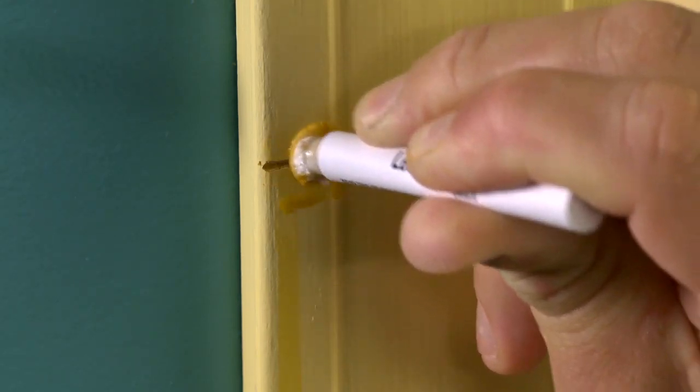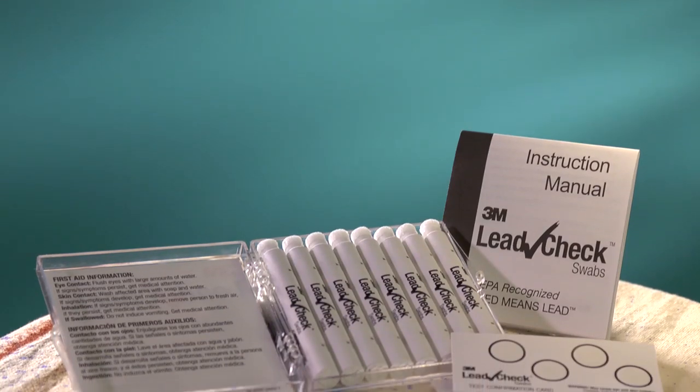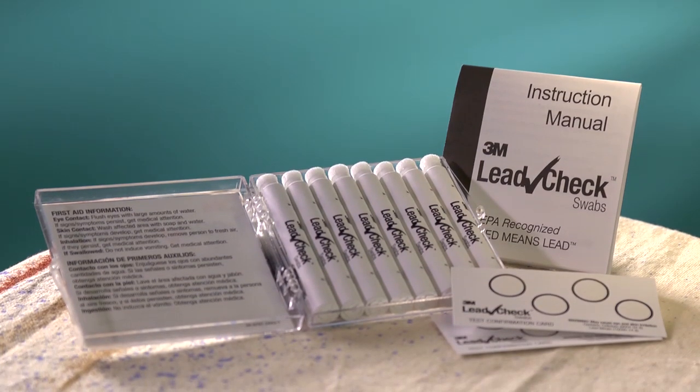This test method is for testing painted wood and metal surfaces for the presence of lead. This method is described in detail in the instructions that are in your kit.